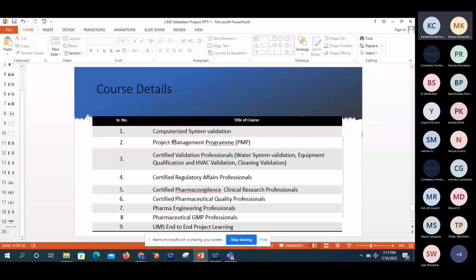Generally, in my experience, I'm telling you, we always depend on the vendor for writing the script. Once they deliver the parsing script, we do the testing. Generally there is a global text, some subroutines and some coding involved in the parsing script. There is a table. In a recent interview, I told them that we take scripting from the vendor, but that person asked, have you written a script like that? Yes, parsing script is also one type of training.